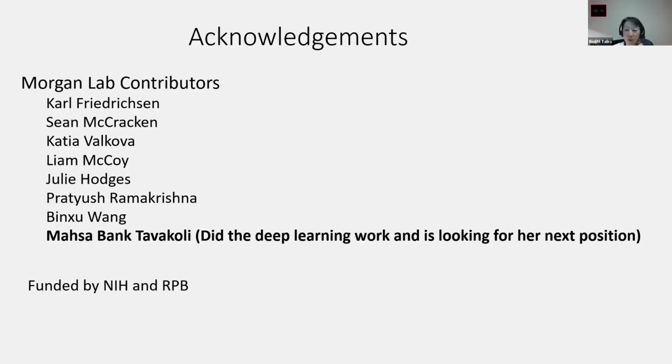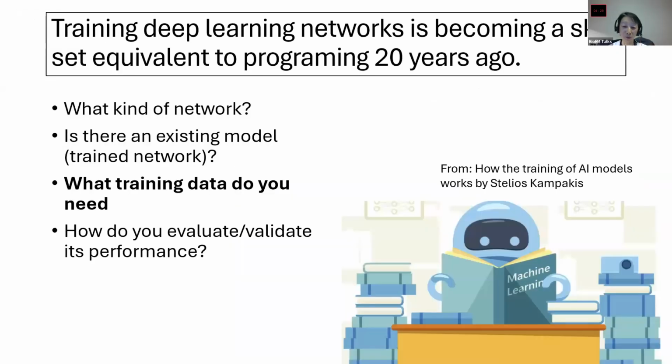I have a question, Josh. So when you use the professional to help you to do the analysis, do you just give them the raw data, or you actually do the alignment first and then ask them to do just one specific process like segmentation or things? Yeah, so usually what we've done is have a folder with either the raw data or slightly pre-processed data. Like we might do a little bit of pre-processing, but not alignment. And they give back the alignment, and then we've done everything else.